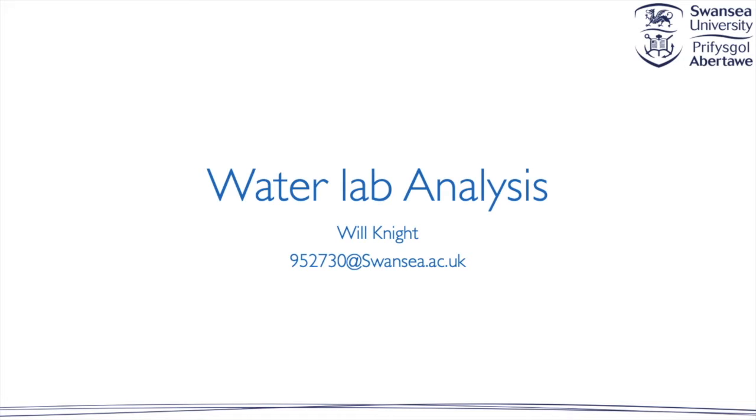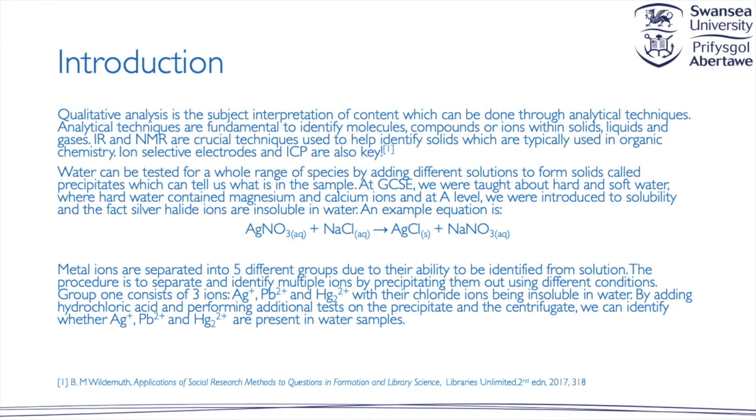Hello and welcome to our water lab analysis of unknown A. Qualitative analysis is a subjective interpretation of content which can be done through analytical techniques. Within organic chemistry we use analytical techniques to distinguish the functional group, so using IR, and the proton and carbon environments, by using NMR.